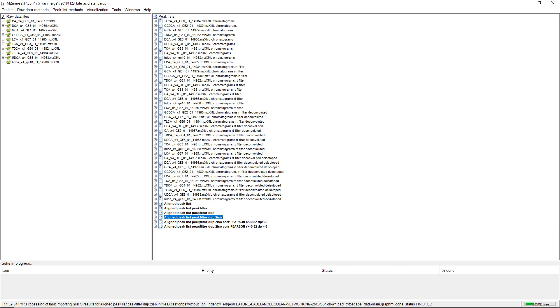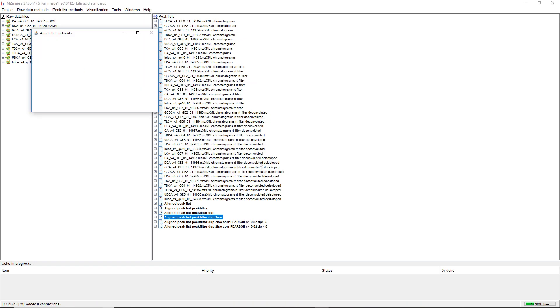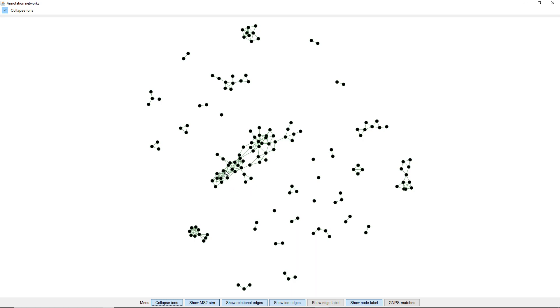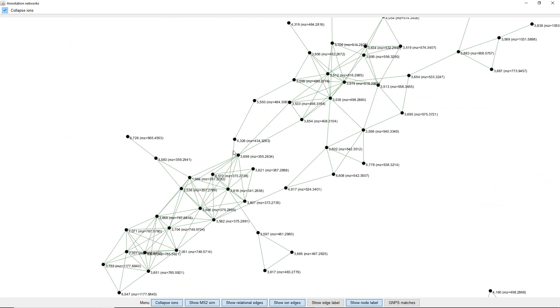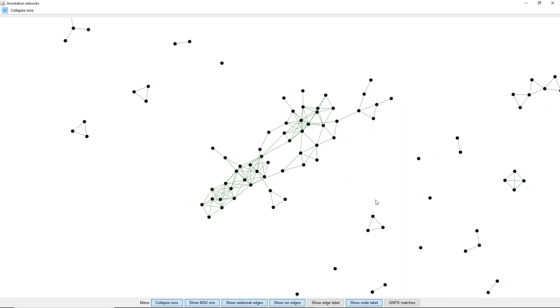Now if we want to visualize the GNPS results, we go on Networks, MS Annotation Networks, and then a new graph opens up. In this graph we can see nodes — the nodes are just features with a chromatographic shape detected in the feature detection step. We have the mass-to-charge ratio, the ID of the feature, and then the green edges, which are GNPS spectral similarity edges — so cosine similarity edges. This is just the basic GNPS network.